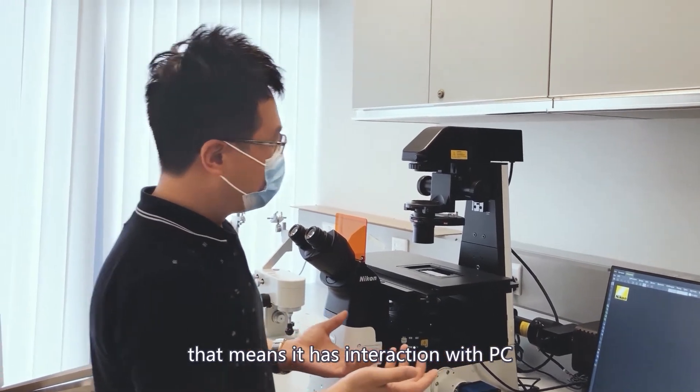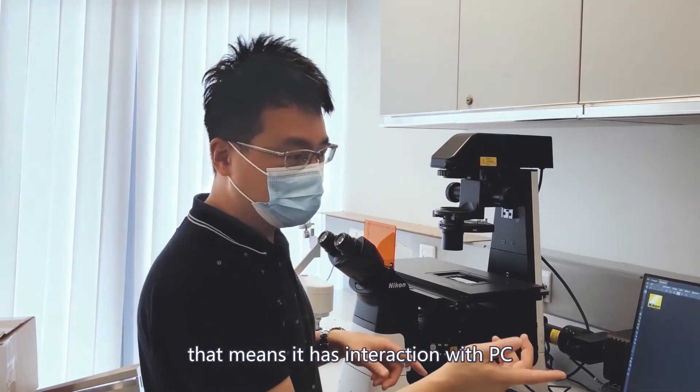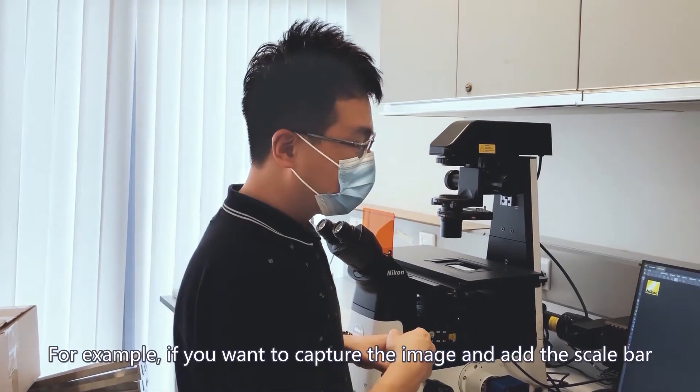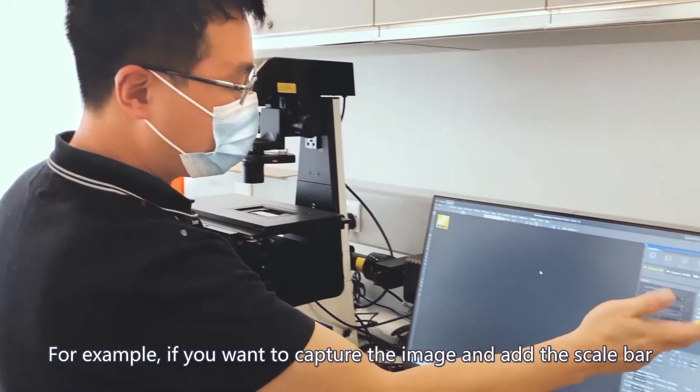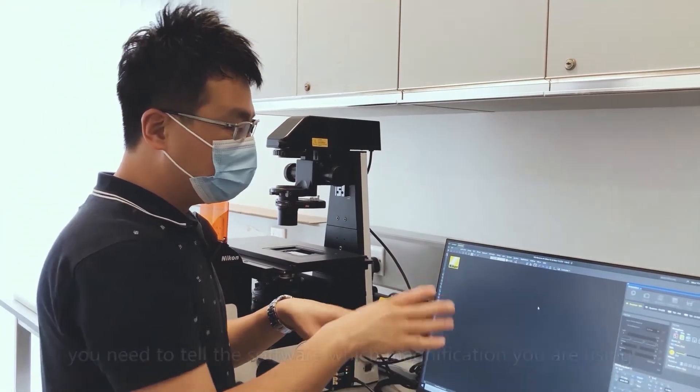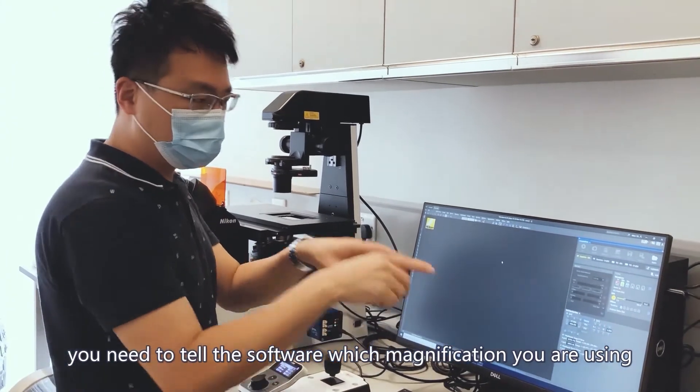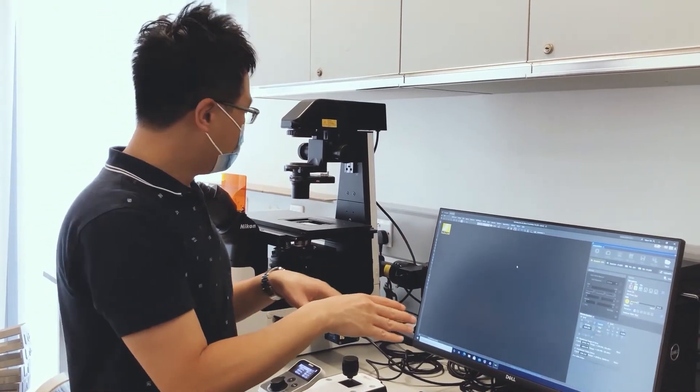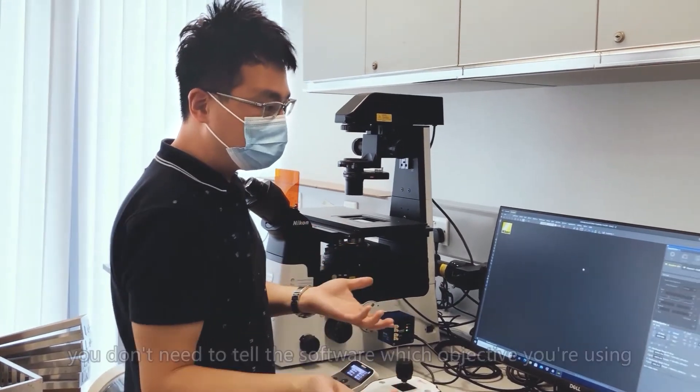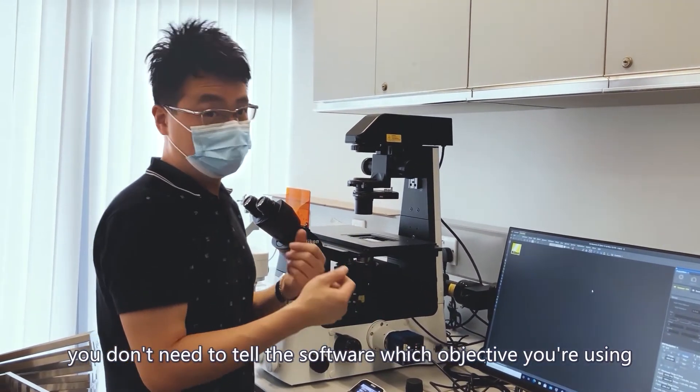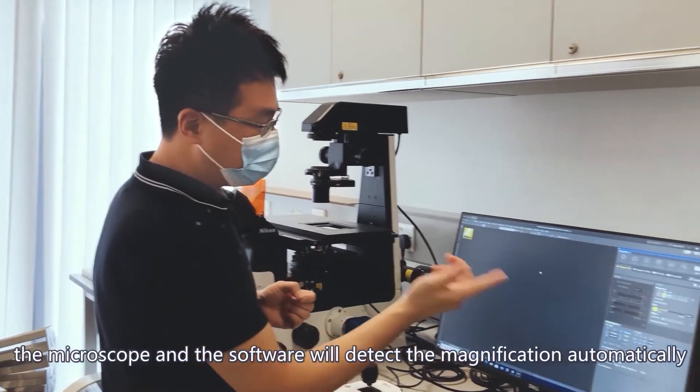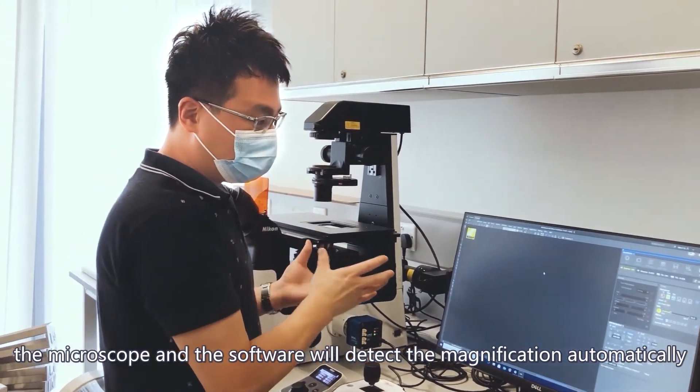That means it has interaction with the PC, so it is very good for imaging. For example, if you want to capture the image and then add the scale bar, if the microscope does not have intelligent function, you need to tell the software which magnification you are using. But if the microscope has intelligent function, you don't need to tell the software which objective you are using. The microscope and the software will detect the magnification automatically.